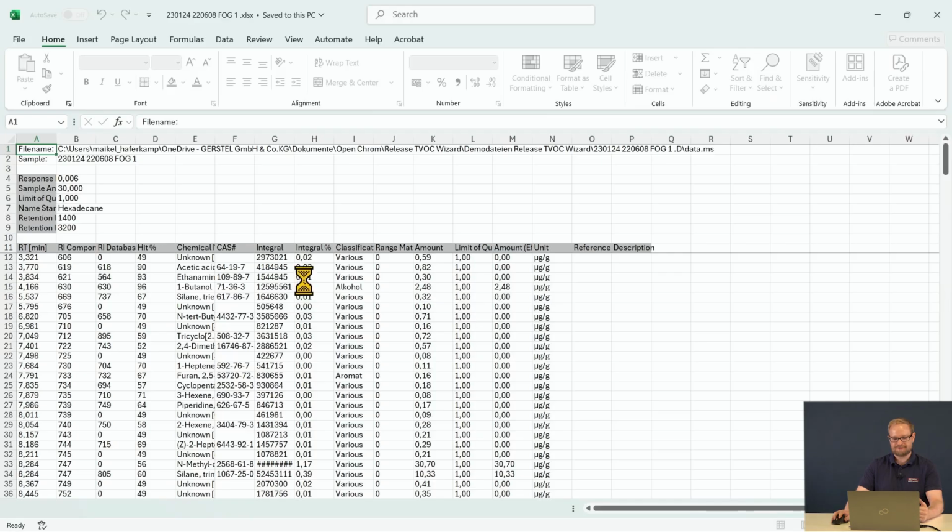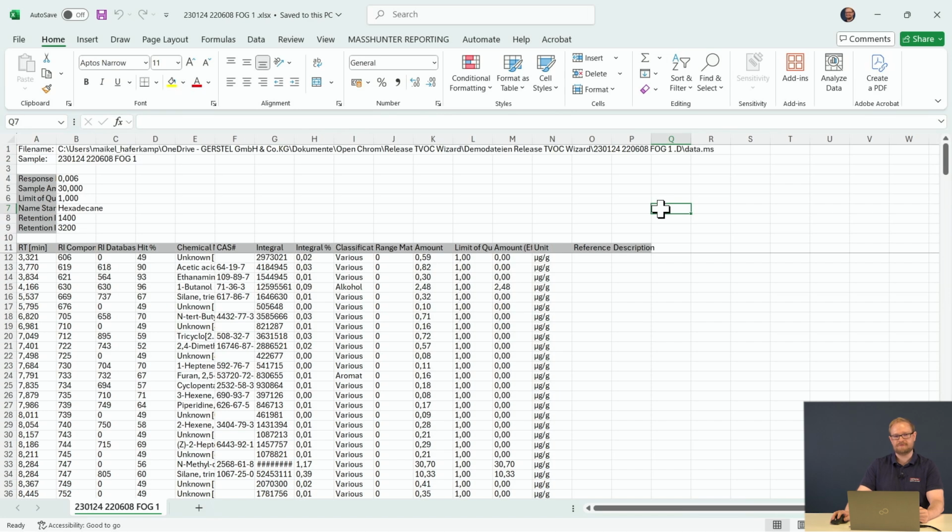We jump right into it to give you an impression of it. The report itself is VDA 278 compliant, but fully adjustable according to your wishes. It has dynamic changing of the formulas, like for the amount. If you just use 100, then the amount would change accordingly.